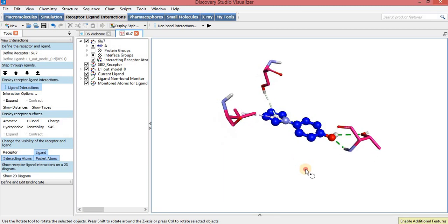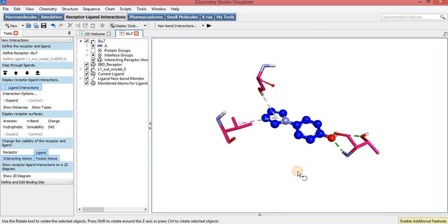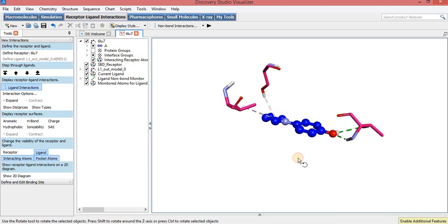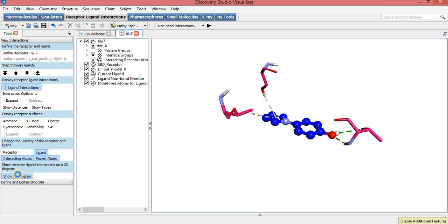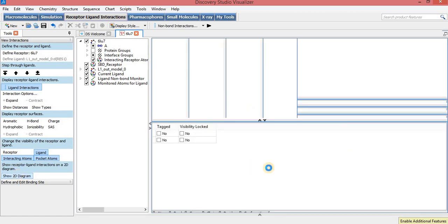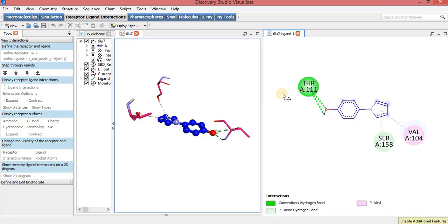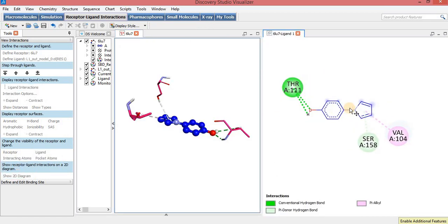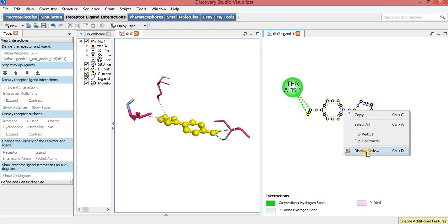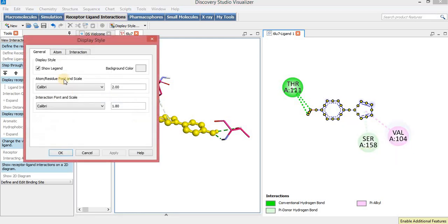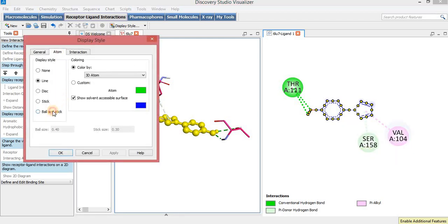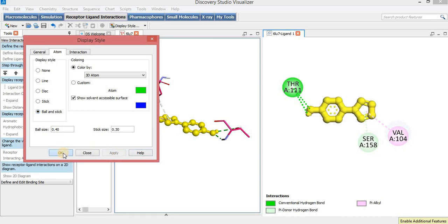Now these are the 3D interactions between the ligand and the protein. Click on 2D Diagram to show the 2D diagram — these are the 2D interactions between the ligand and the protein. Here, to change the display style of the ligand, select the ligand, then Display Style, and I will select a Ball and Stick model for the ligand, then Apply and OK.